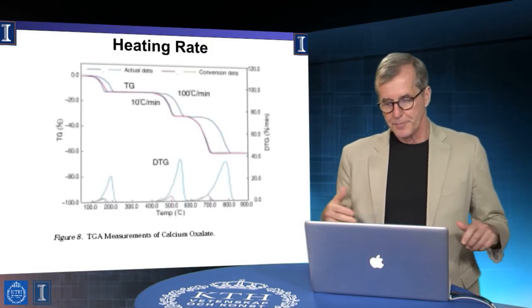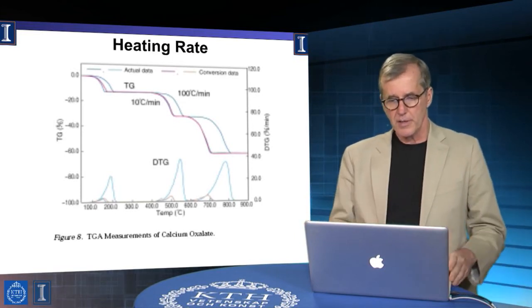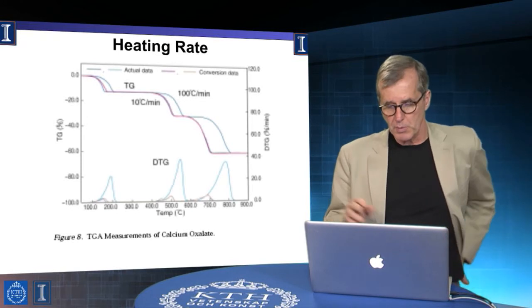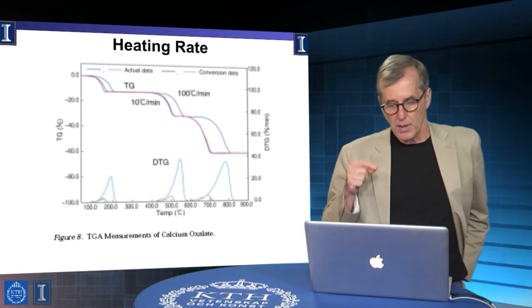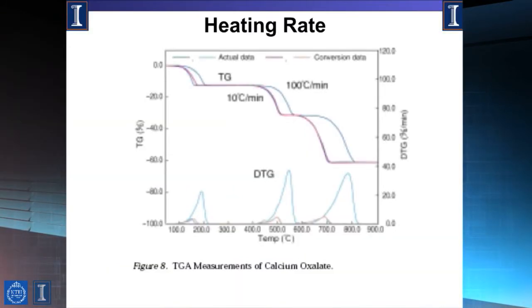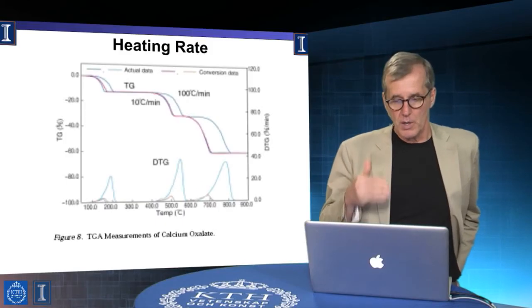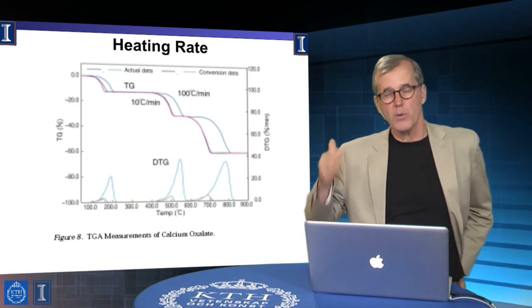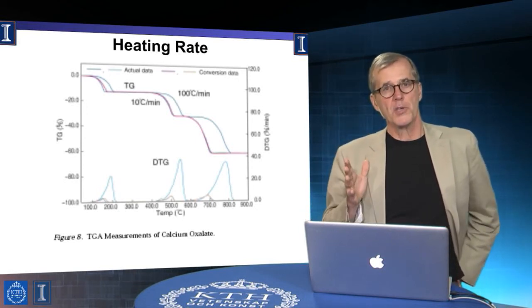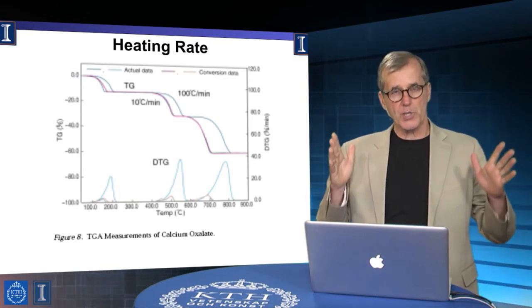Okay. I'm sorry for the quality of this slide. It did not come across very well. It's a little bit blurry. The point being laid out here is that, as noted with TG and DTA measurements, the temperature ramp rate matters, right? There is an underlying kinetic attribute associated with these measurements, and I think the easy way to understand why it would be sensitive is to imagine how this measurement would go in each of two limits of temperature scan rate, okay?